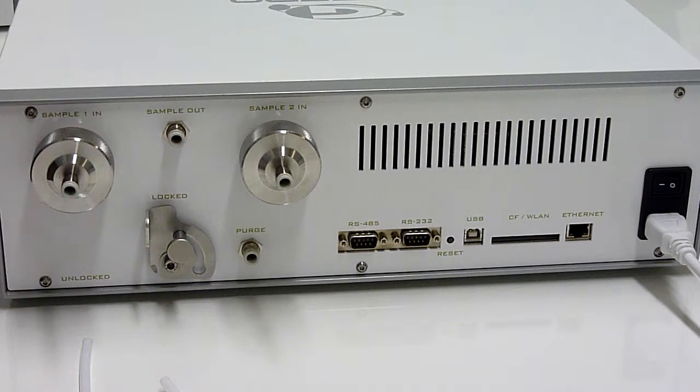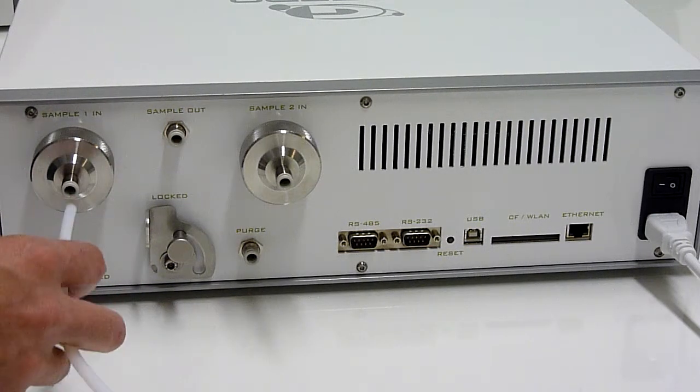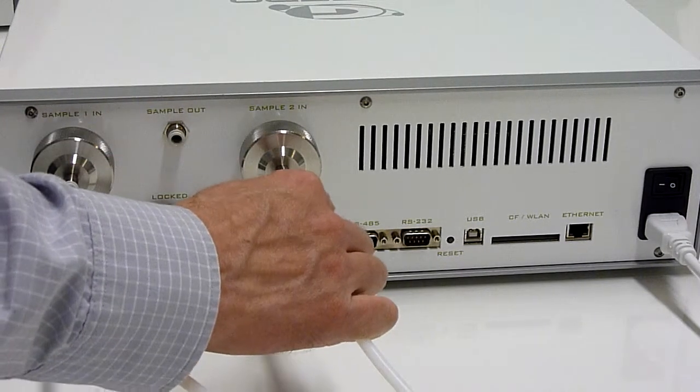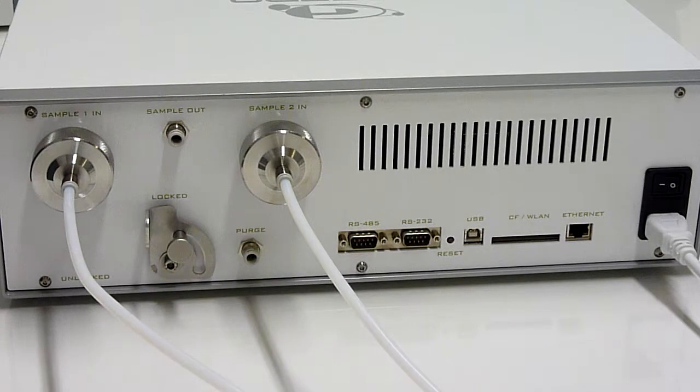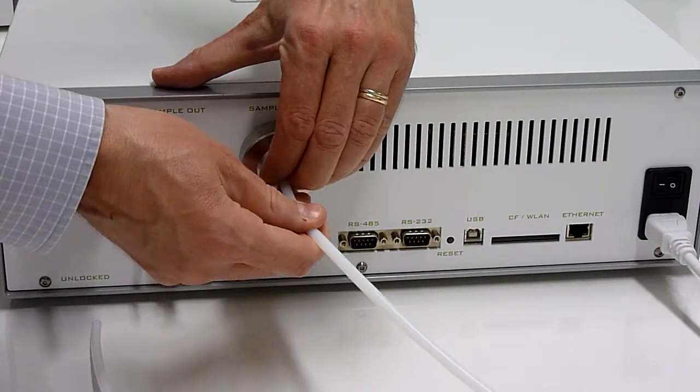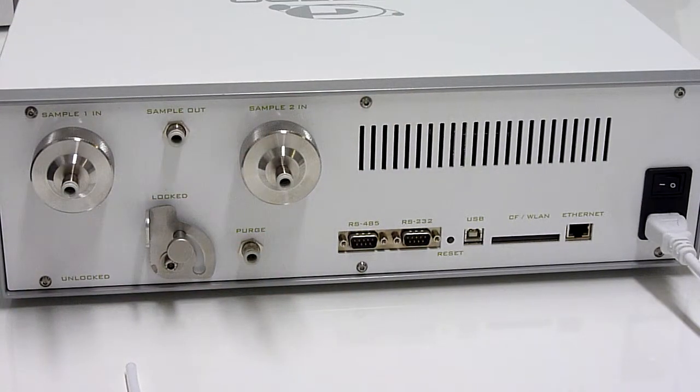If you are using push-in type connectors, you simply push the gas tubing inside the connector. Releasing the tubing can be done by pushing in the locking mechanism and pulling out the tube.